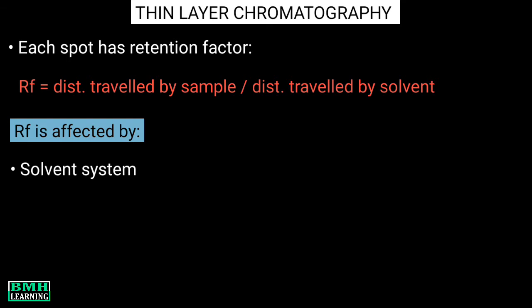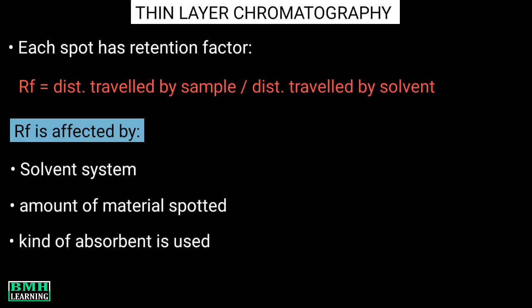These are the solvent system, that is the type of solvent used. It also depends on the amount of material spotted. It also depends on the kind of adsorbent used and also the temperature.